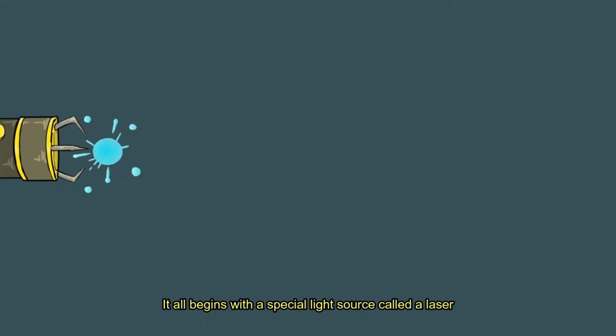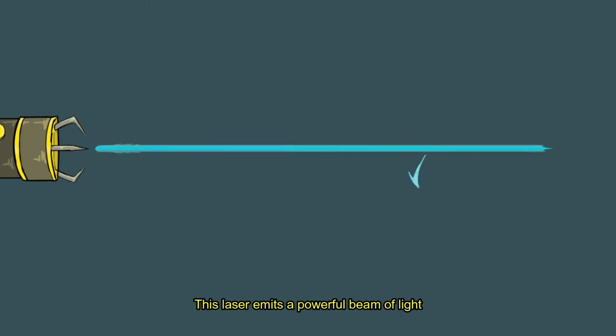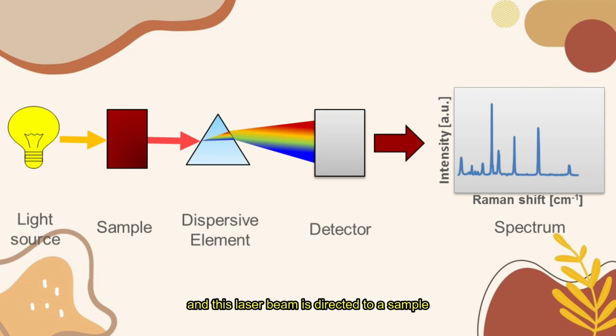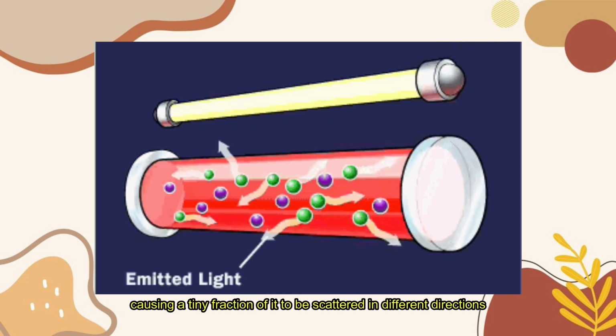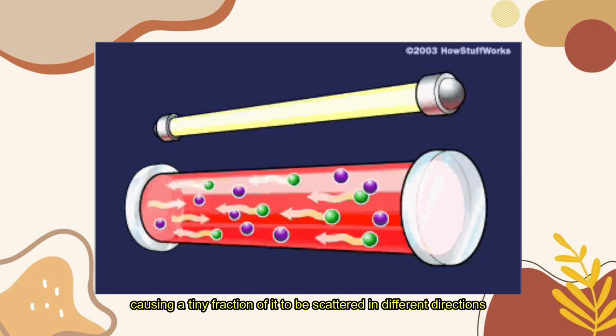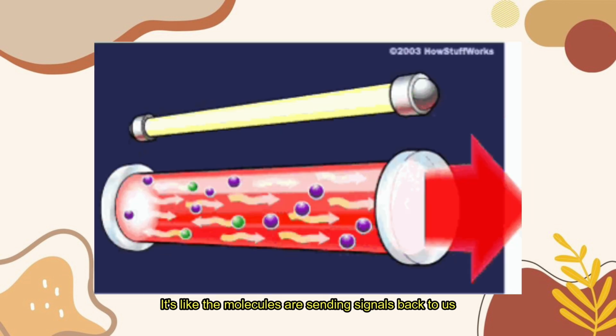It all begins with a special light source called a laser. This laser emits a powerful beam of light, and this laser beam is directed onto a sample, just like a spotlight shining on a stage. When the laser beam meets the molecule in the sample, the light interacts with the molecule, causing a tiny fraction of it to be scattered in different directions. It's like the molecules are sending signals back to us.